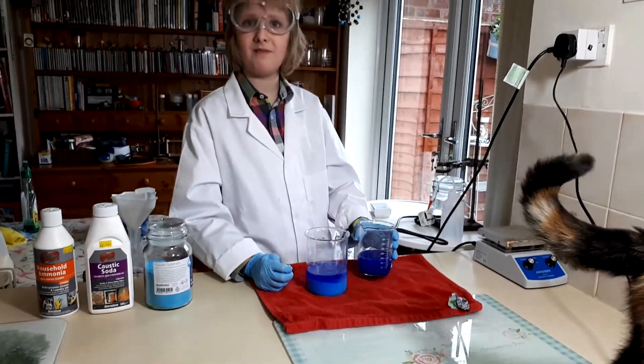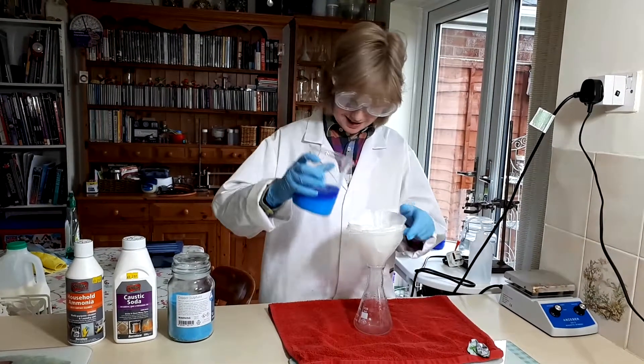I've let all the copper hydroxide sink to the bottom. Now what I'm going to do is decant off most of the water. Now I've got most of the water out, I'm going to pass it through a filter.